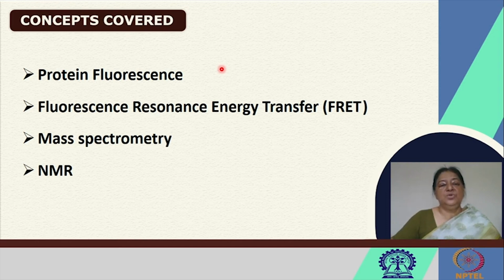This can lead to us identifying donor acceptor distances that are important in understanding the folding of proteins or even multi-subunit proteins to see the proximity of specific donors and acceptors that may also be tagged along into the proteins. Another aspect is looking at protein ligand binding, where we could have donor to acceptor energy transfer.